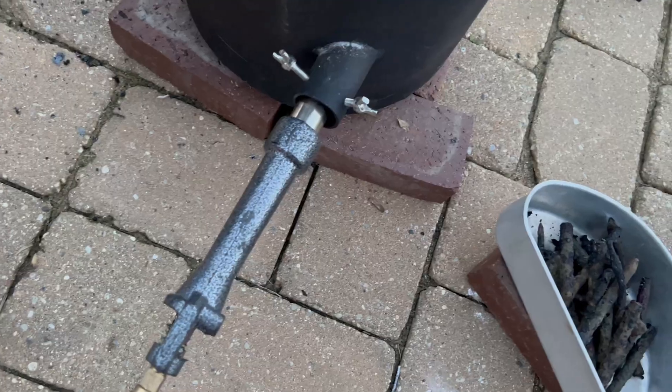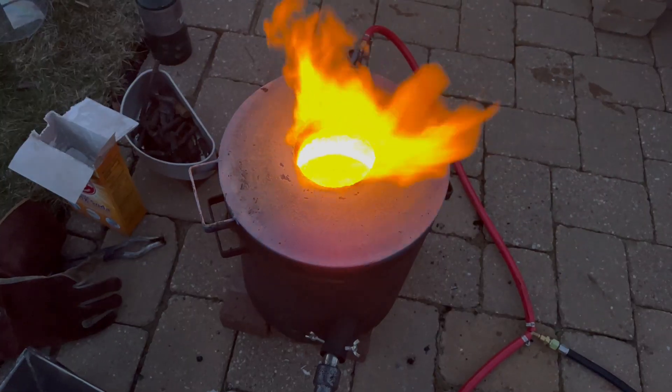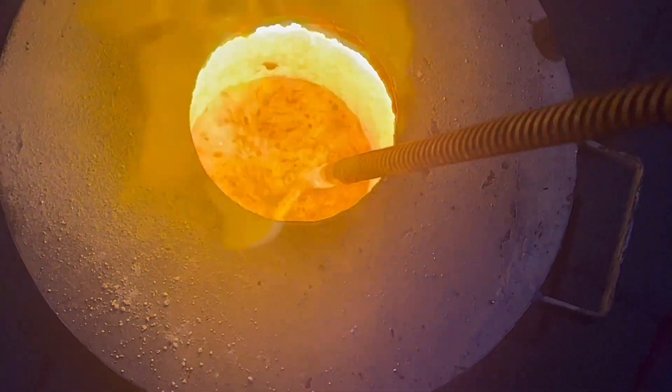Now it's time for the next run. I repeated the same exact process: start the furnace, melt, add iron, stir, stir, stir, wait, and wait.